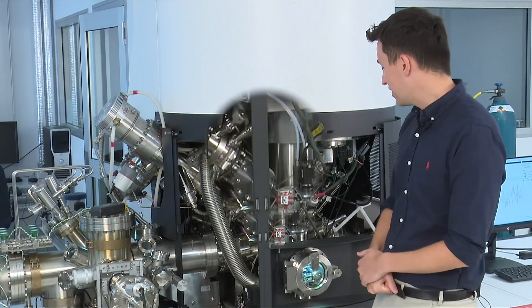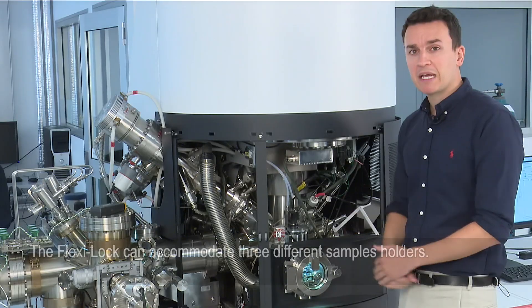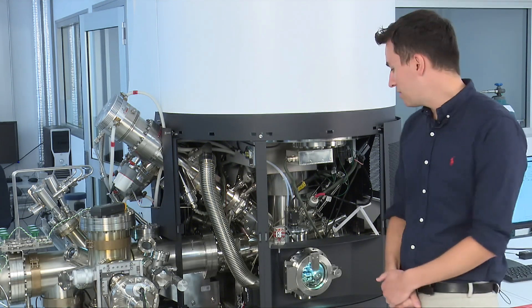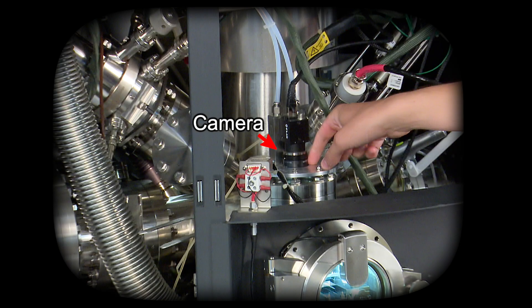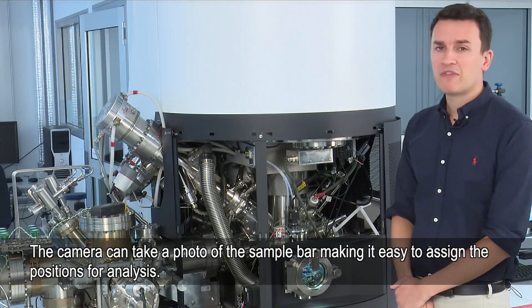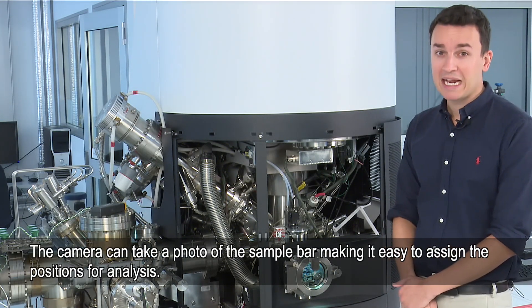Here is the Flexi-Lock. It's quite a large chamber — big enough to accommodate three different sample holders. It has a camera at the top which can take a photo of the sample bar, and with that we can then assign the positions for the analysis.